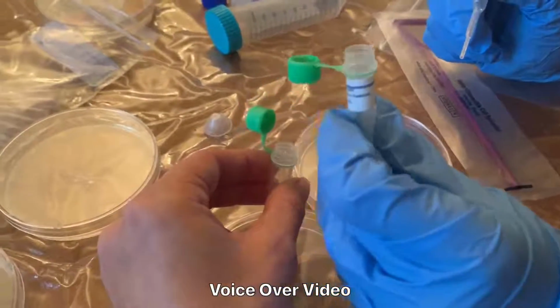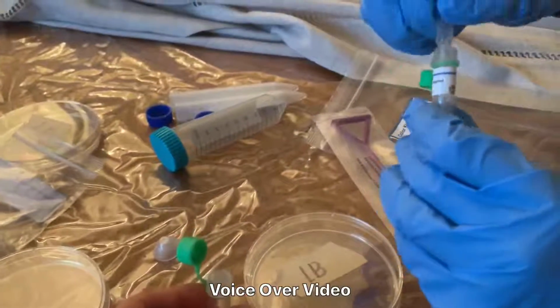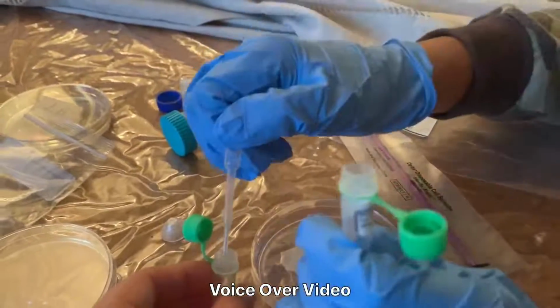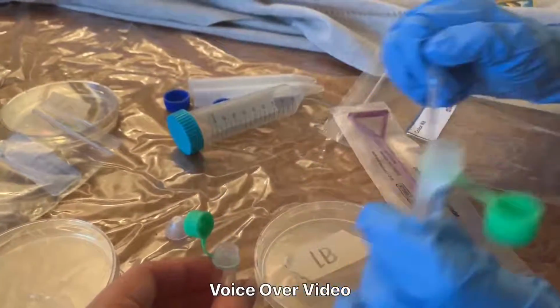So I put that in, because there's bacteria and there's the other bacteria, so I mixed the two bacteria and like the DNA and everything.